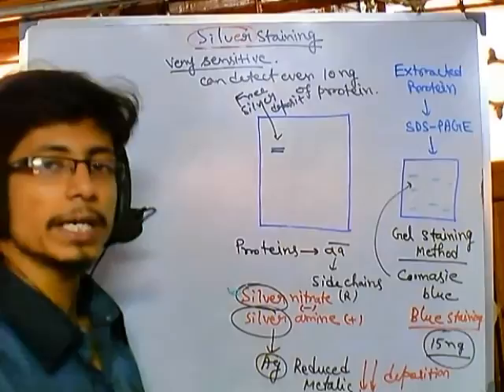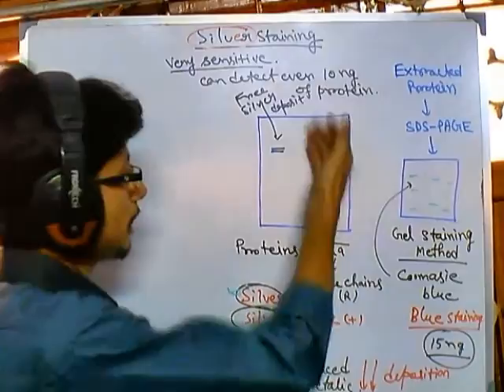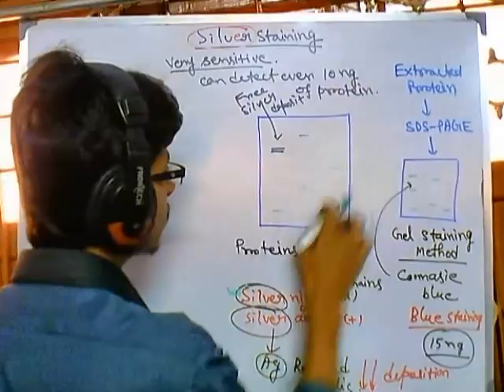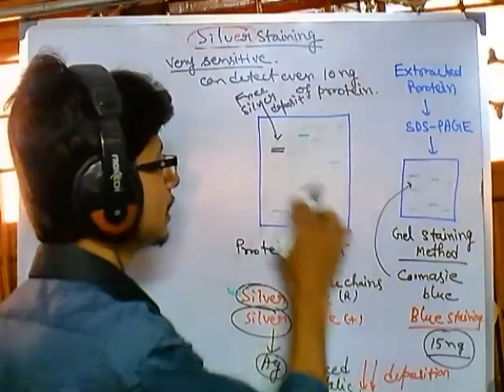Another important thing is the rest of the gel. There is a question: can the silver nitrate be reduced in the rest of the gel, except for proteins? The answer is no, not at all, because the reduction of silver can only be achieved when it reacts with the side chain of a protein. Suppose there is a protein here. Except for that, the rest of the regions are protein free, so these regions will not bind with silver nitrate and will not reduce silver into free metallic silver. So we won't find deposit in these regions. We only find deposit where they are interacting with proteins.